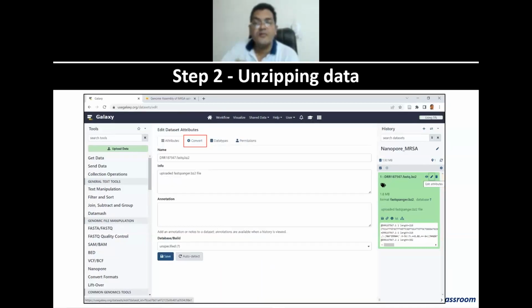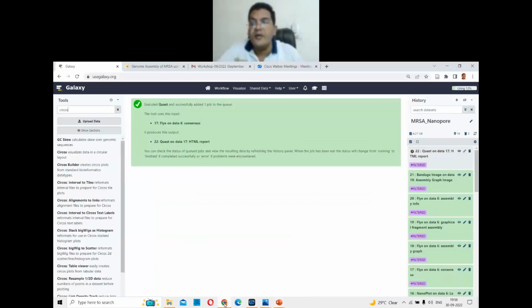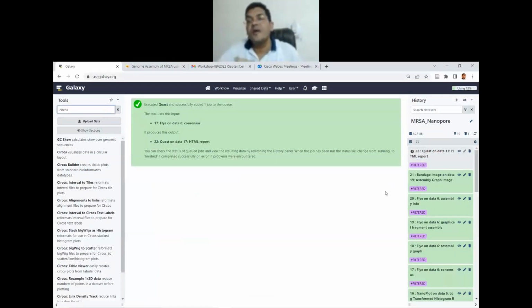So that is where we are now. Let us see if our process is finished. It is still queued, so it has not even begun yet.